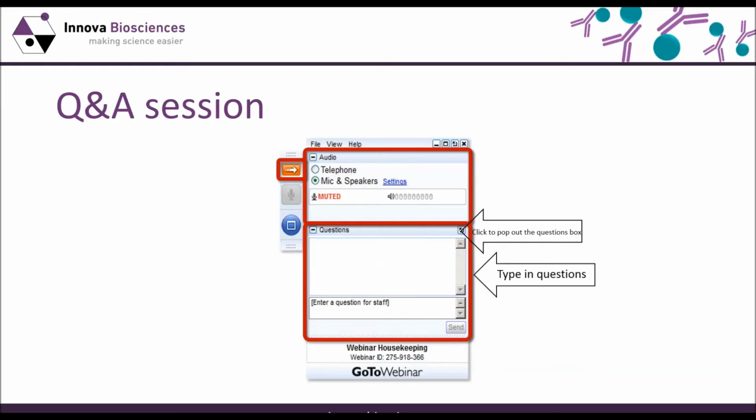The limit of detection in an Immuno-PCR assay will vary depending on the choice of antibody, but it can usually detect the antigen at around 1,000-fold lower concentration than that which would be detected by an ELISA against the same target.